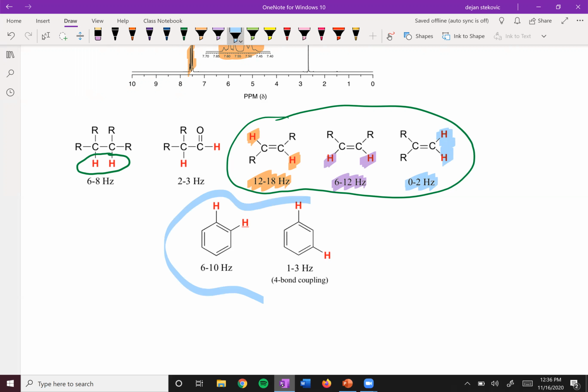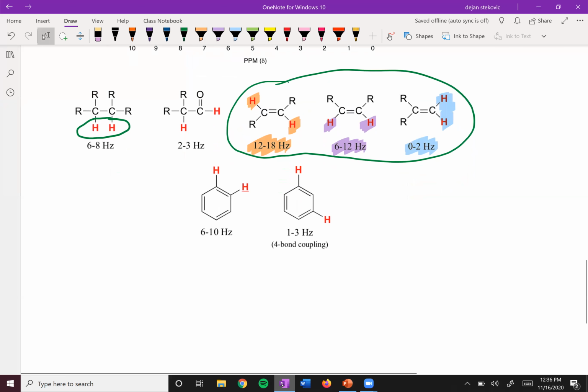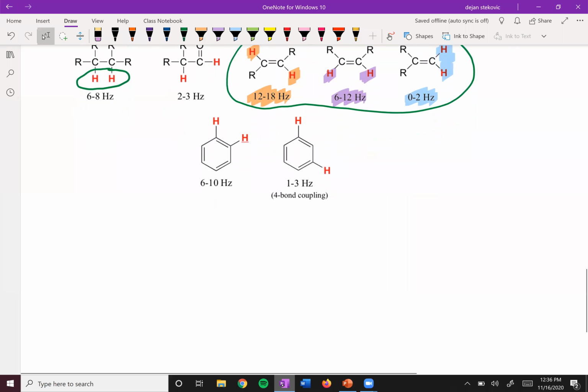You can also tell aromatic rings have some more complex coupling with this. What this is called is meta coupling, right? This 4-bond coupling. Again, this will be pretty rare for this class. You won't see any NMR spectra and be expected to deduce these values, but you may be asked other types of questions. So check out the work along problem set, that kind of questions.